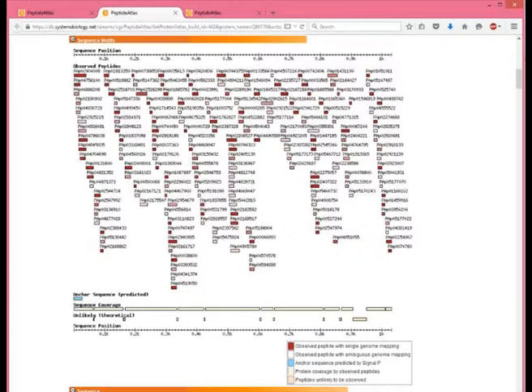And these ones that are unlikely are generally because they're too short or too long. Too short is 6 amino acids or less, and too long is, I believe, 50 amino acids or more. And so for all intents and purposes, we have seen everything from this protein that we're going to see.